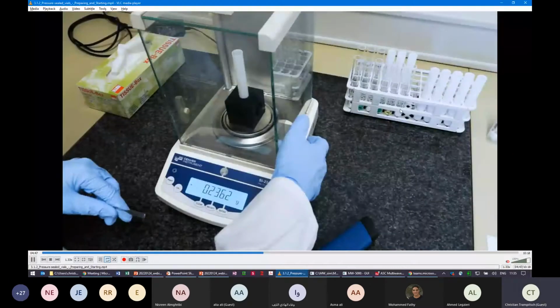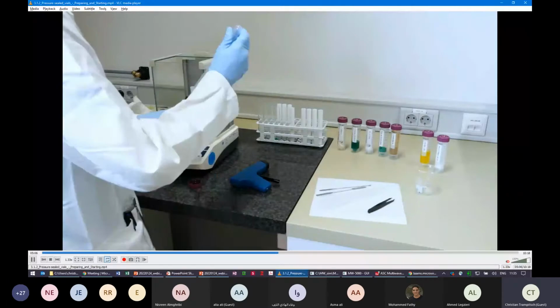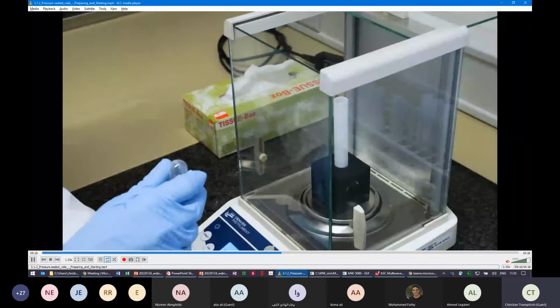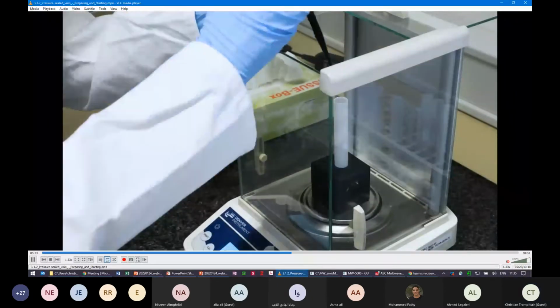If sample sticks to the TFM vial, it can happen that it absorbs microwave energy, that you get a local overheating, and you can destroy the Teflon vial. Luckily, nothing else will happen. You will just destroy this vial, but you will not destroy anything else. The other samples will not be compromised. Then you can still analyze them after the digestion.